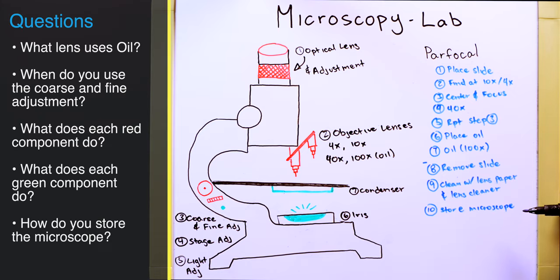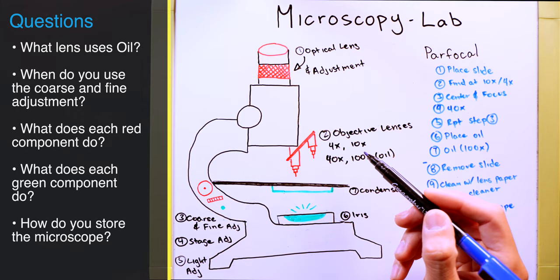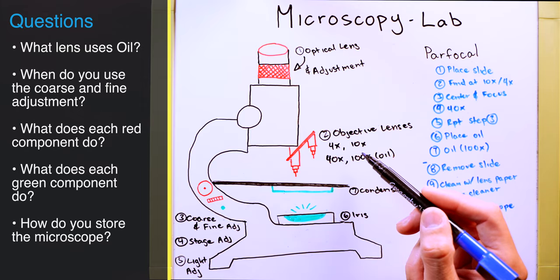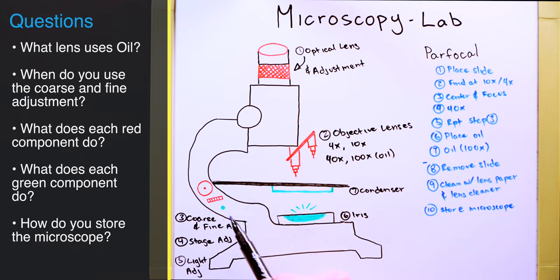And the proper way to store your microscope is going to be lowering the stage all the way, bringing the objective lens to the lowest magnification, which is the 4x. If you have a light switch here, bring the knob all the way down and then turn it off.